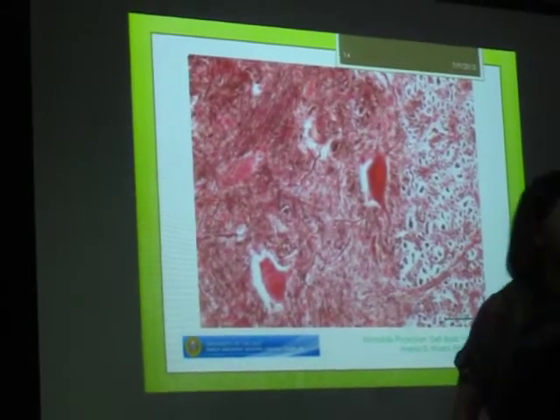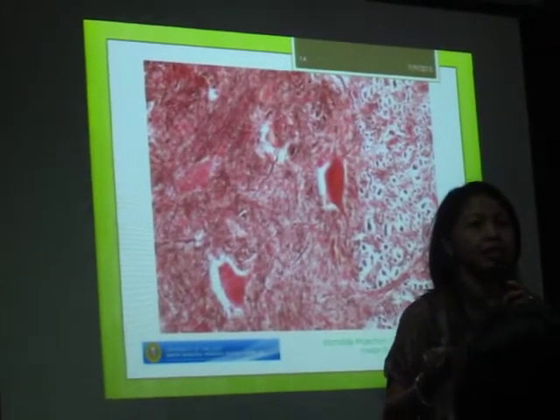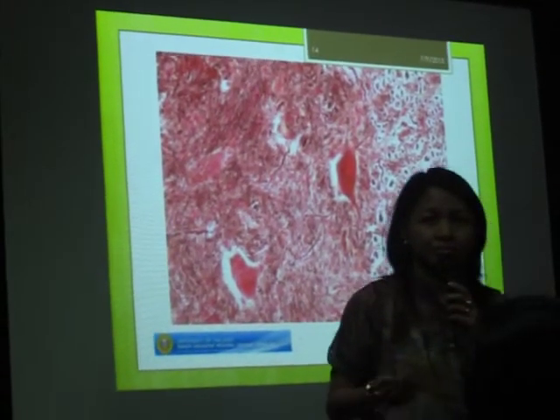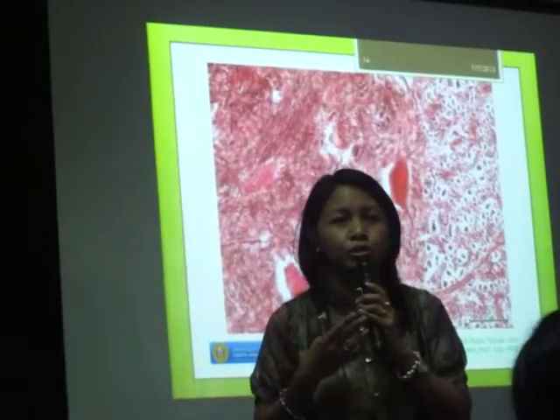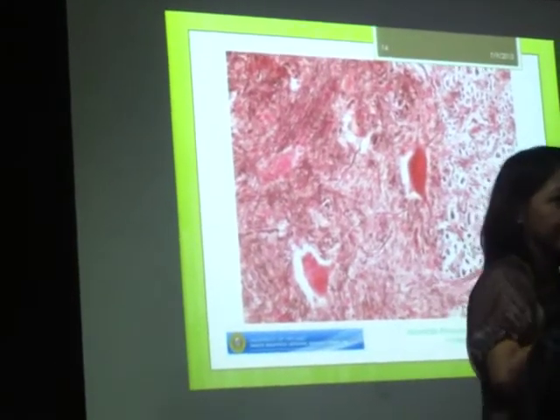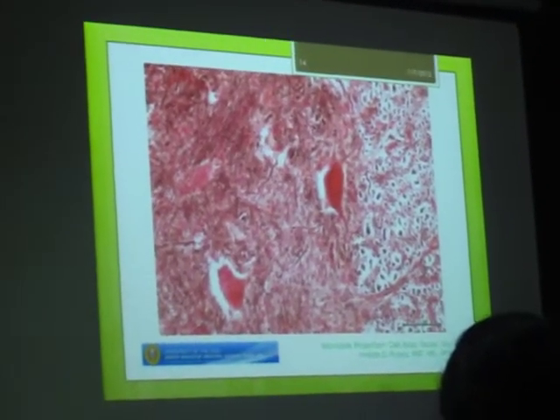So it's a motor neuron, motor. When you receive stimuli, that's a sensory neuron. And when you send signals to body parts, to muscles especially, that's a motor neuron. Okay, so motor neuron.